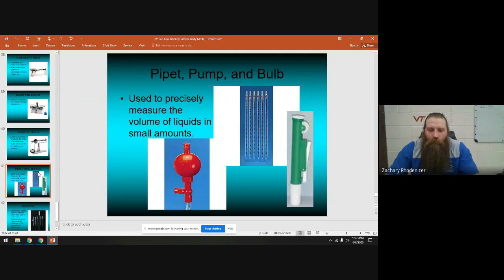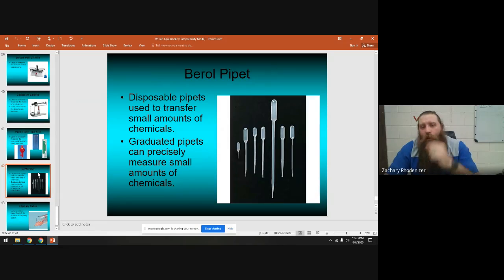Pipettes, pipette bulbs, and hand pumps are used to transfer liquids — you probably used those in biology. The barrel pipettes are disposable and are the ones we'll use most. They say one milliliter or sometimes 10 milliliters on the side, but I wouldn't trust them for measurement — use your graduated cylinder to measure volumes. Use pipettes to transfer liquids.